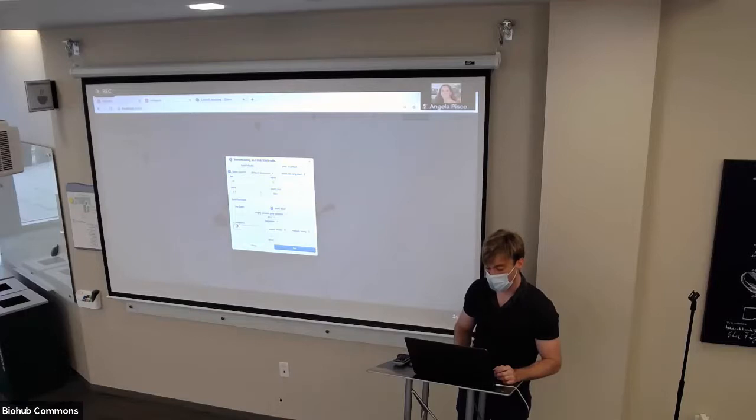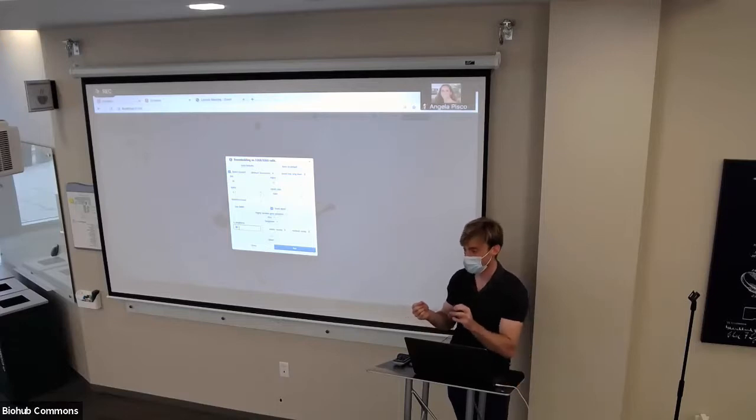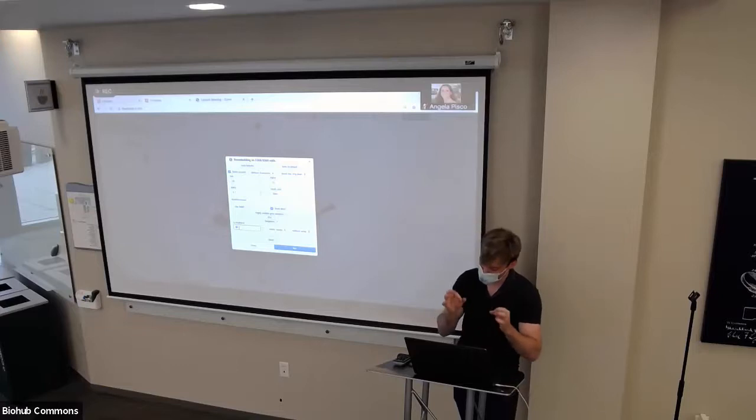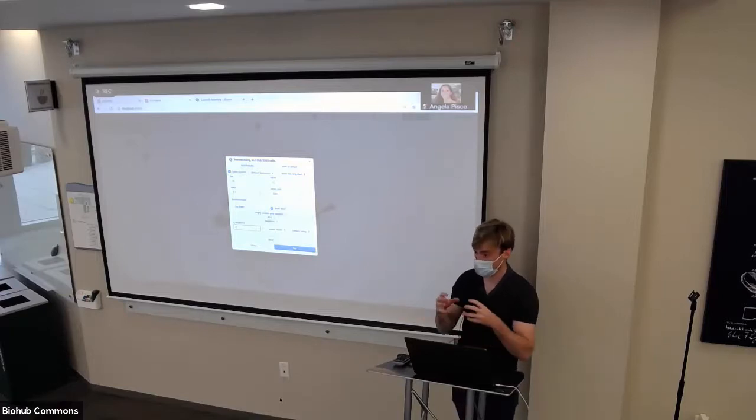So this is kind of choosing the length scale of your analysis. If you have a cluster of like 5 cells, and each cell in that cluster is going to be choosing 20 nearest neighbors, that cluster will be fused to something else. So if you have really rare cell types and you want as much granularity as possible, you might decrease it down to 5 with the understanding that other clusters might start getting fragmented.